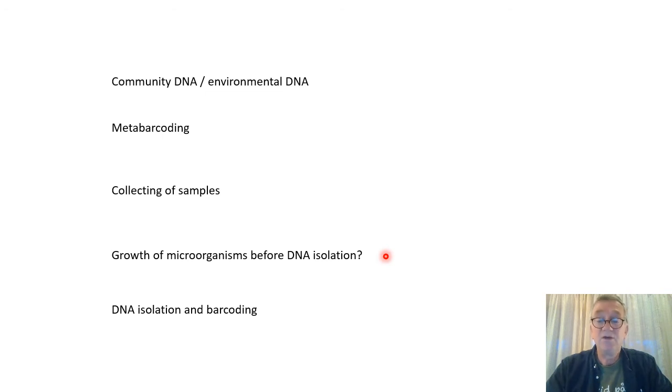So we might lose some species because of that. In those cases, it could be good to just start sequencing right away. Right. So what has been done now is that before this lecture, this lab exercise, I have done some growth of the microorganisms, both from the compost and from the keyboard samples.